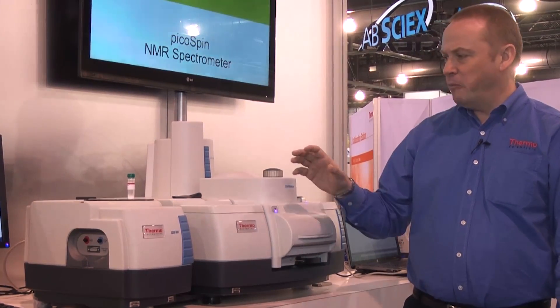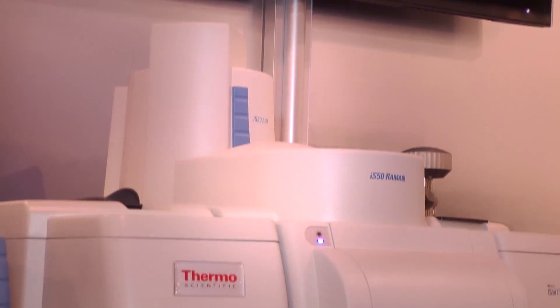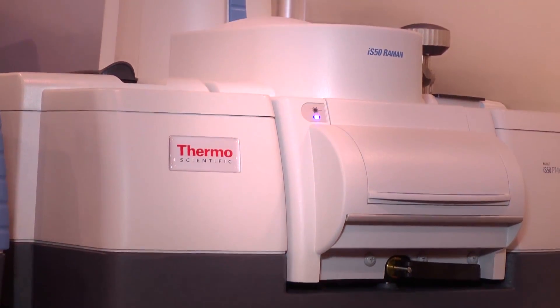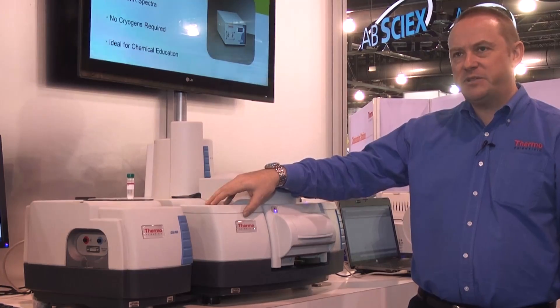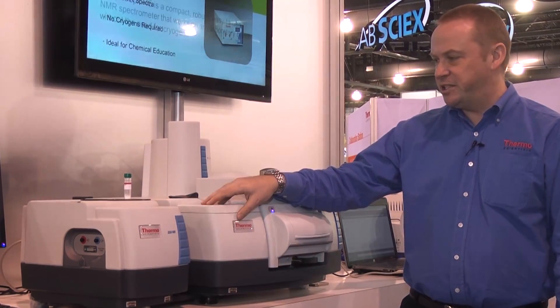So with this system we can switch between those techniques extremely quickly. The system starts with a research grade FTIR spectrometer and can be built out from there as the customer needs to add capabilities.